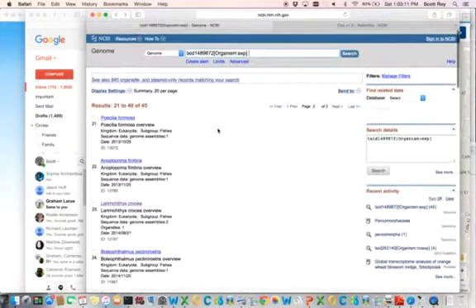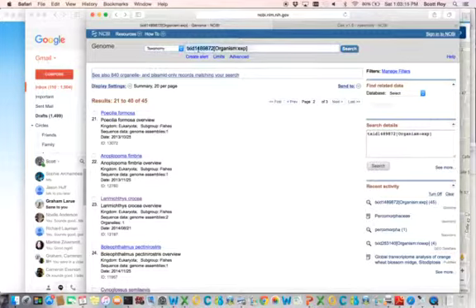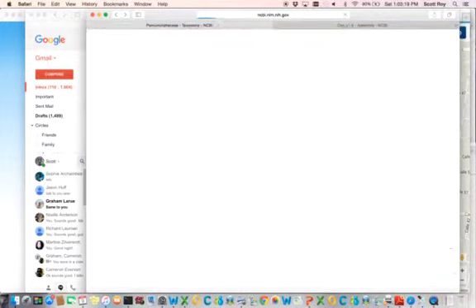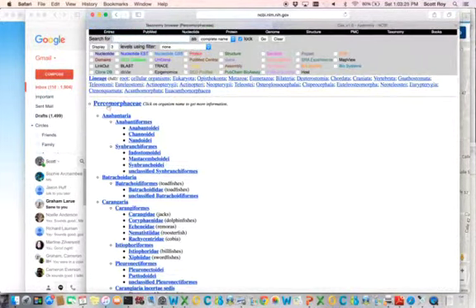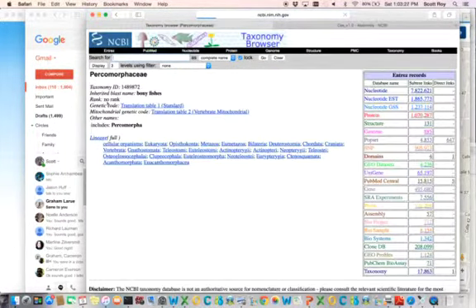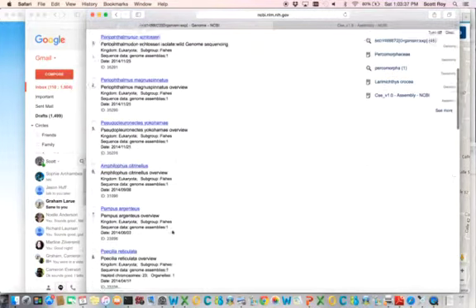Go to NCBI, and the quickest way to get to where we're going would be to go to the Percomorph page. I think you've been here in taxonomy. So notice that's in taxonomy here. And then we click here and click through to get to this page where they have the percomorphs, all the data that's available. If we click on genome, I'm guessing this is where you've been before. We see all these different species.